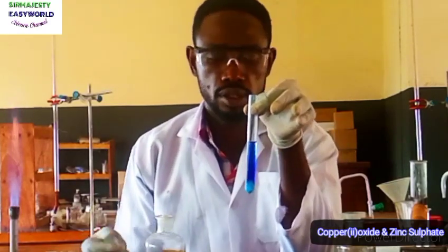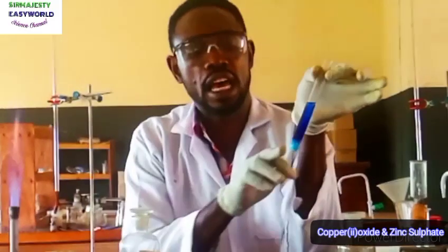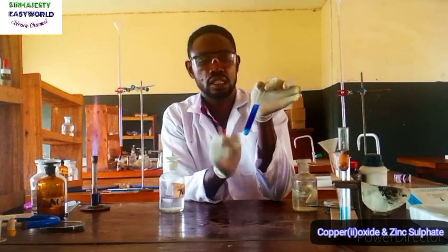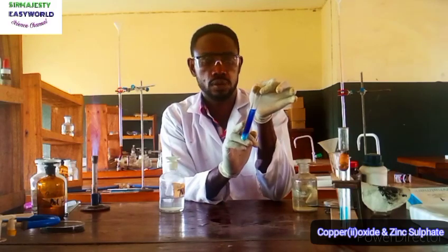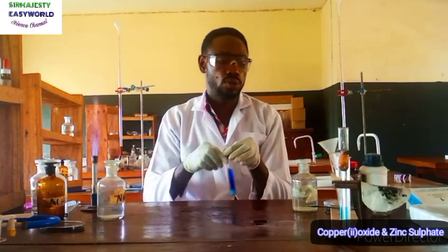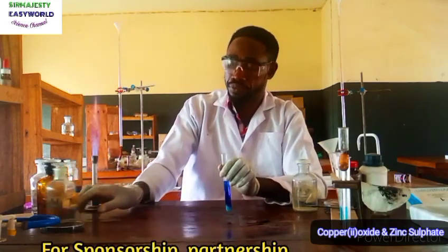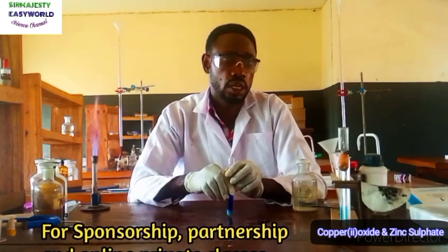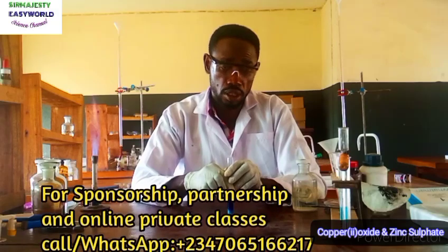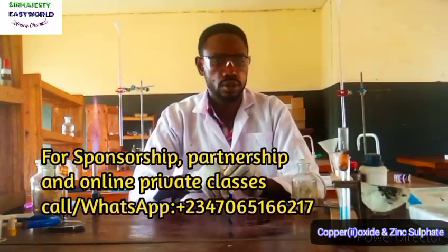In your inference, your observation is: with aqueous ammonia in drops, it forms a light blue gelatinous precipitate, as you can see here at the base. Then in excess, the light blue precipitate dissolves to form a deep blue solution, and that confirms copper 2 ion. So from this analysis, you have seen how to test for copper 2 ion, how to confirm zinc ion, and also how to confirm tetraoxosulphate 6 ion.